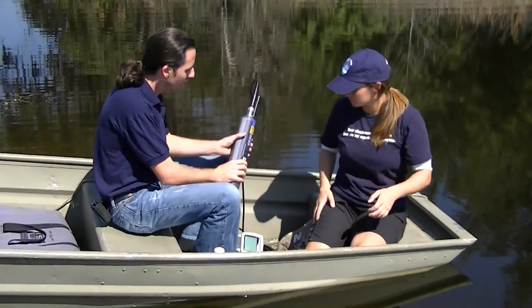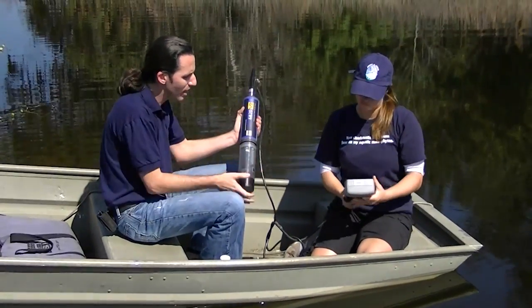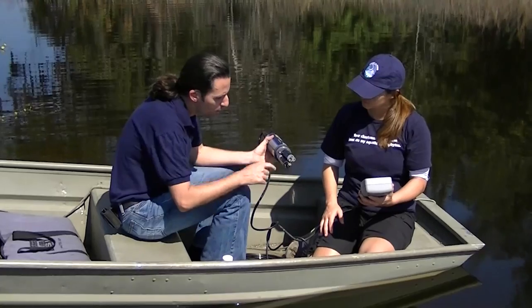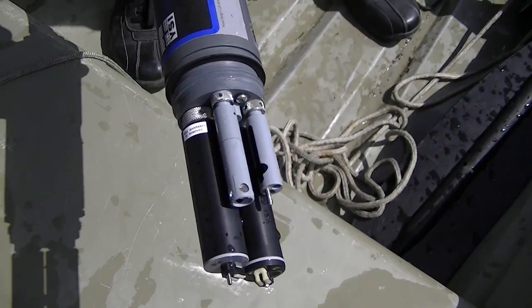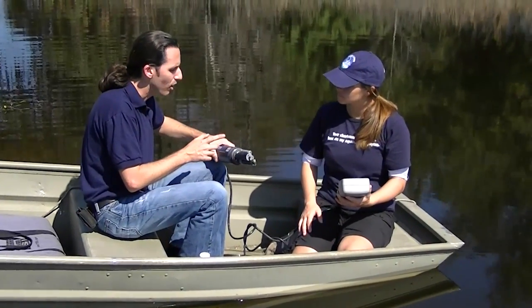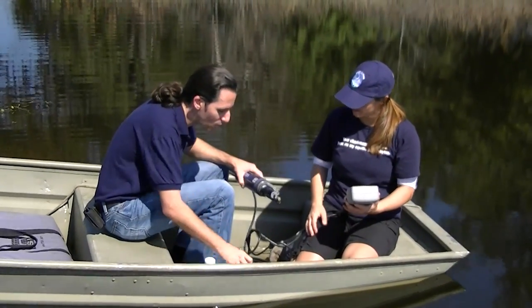So the first thing I want to show you is this device right here. This is a YSI multi-probe. Inside here we have several different probes that you lower into the water, and they take readings on dissolved oxygen, temperature, and pH all at one time. It's a really good way to do it — a lot of scientists use this. Unfortunately, it's a little expensive, so we can't give them out to volunteers, but this is what we use.